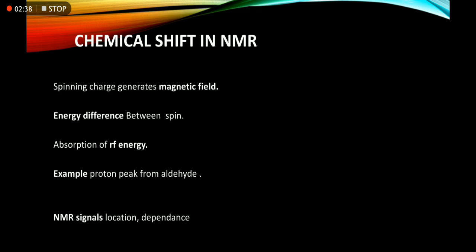However, a frequency scale is commonly used to designate the NMR signals, even though the spectrometer may operate by sweeping the magnetic field, and thus the 42 parts per million is about 4200 Hz for a 100 MHz reference frequency RF.